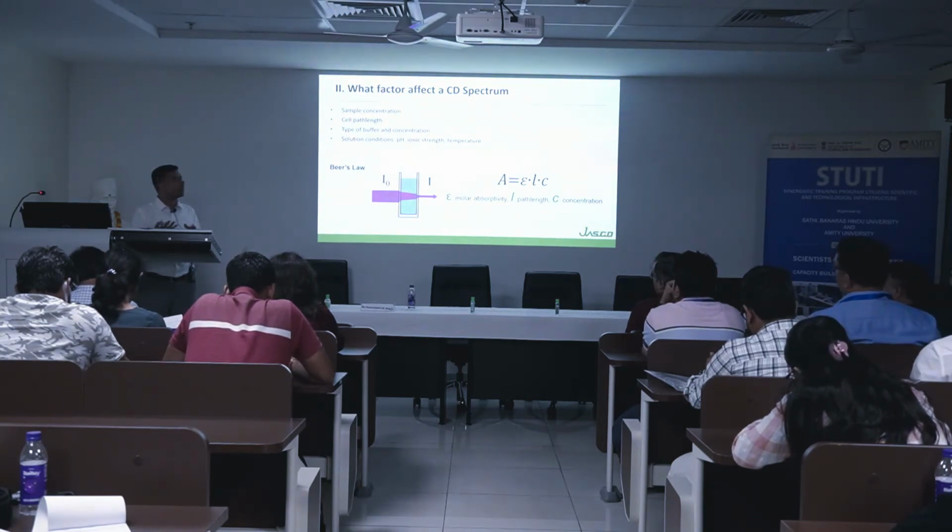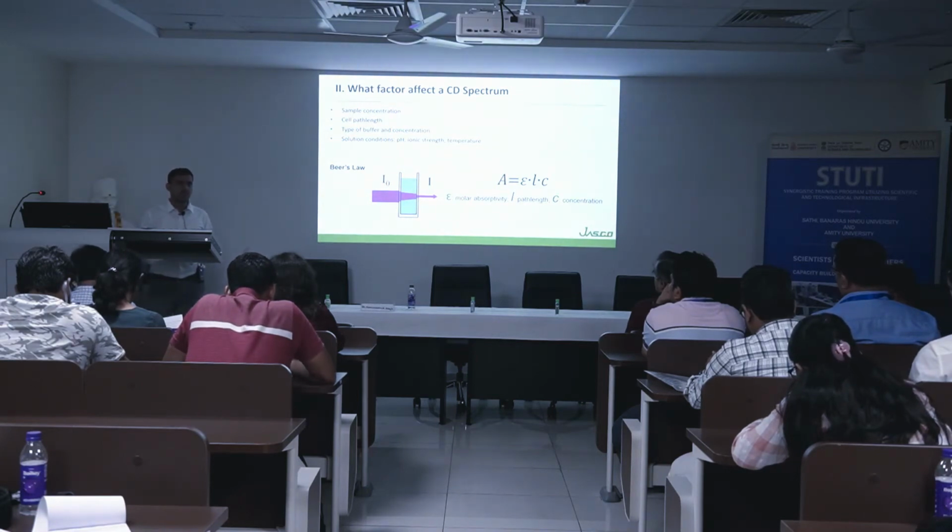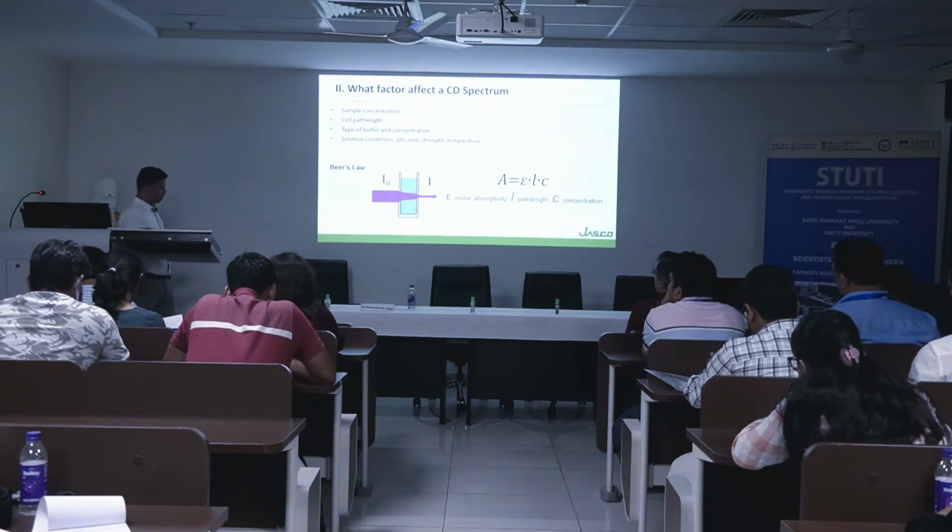We recommend 50 millimolar, that's okay. Don't go beyond that. Even sometimes people work with different chloride-based buffers, and we don't recommend that because they interfere in the wavelength range. So, different things.